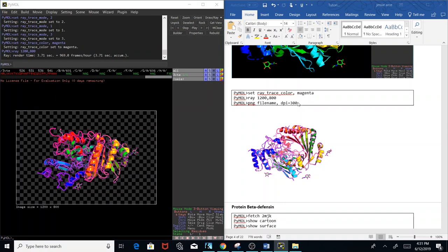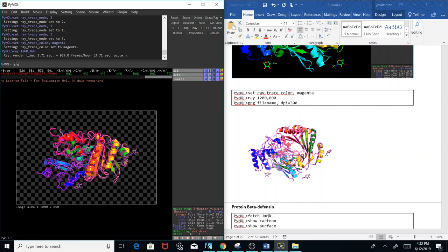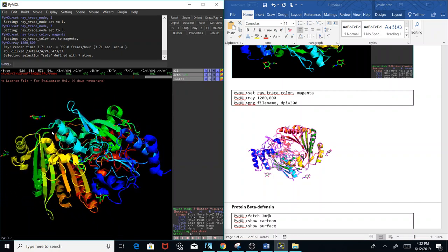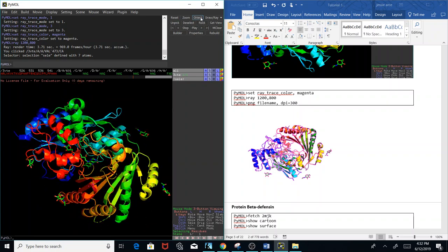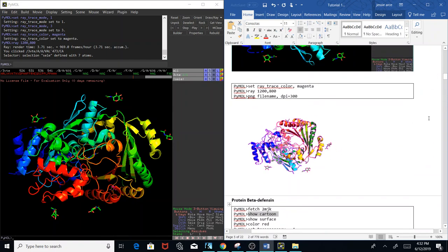To save the picture, you can copy and paste the commands. All the code is already there — just copy and paste them one at a time. Use 'png' followed by the file name, such as 'practice' or 'example', then comma and DPI 300. That's how you create a PNG file. If you don't like the orientation, you can click reset or 'orient' to get a different position. That's a picture of the THC synthase protein.